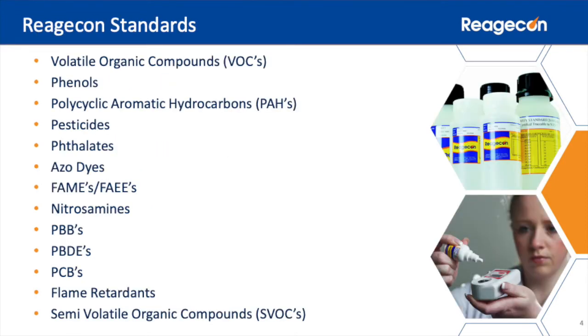Like almost all analytical techniques, gas chromatography and high-performance liquid chromatography are comparative. That means that the instruments must be calibrated with a known, the standard, and this is compared with an unknown, the sample. In general, because chromatography is a sensitive, accurate, and relatively sophisticated technology, the knowns usually take the form of a full calibration curve. There are also instances where other types of standards, such as internal standards and surrogate standards, are also used. All of this is explained in several other Reagecon publications.